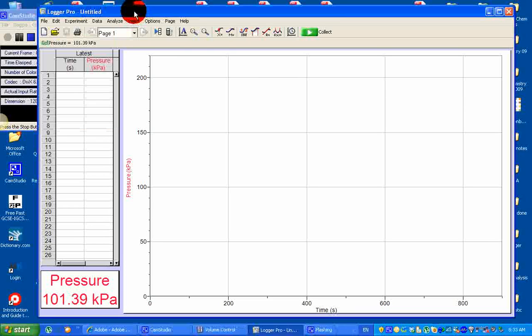I'm going to demonstrate a video tutorial on the reaction between magnesium ribbon with hydrochloric acid.